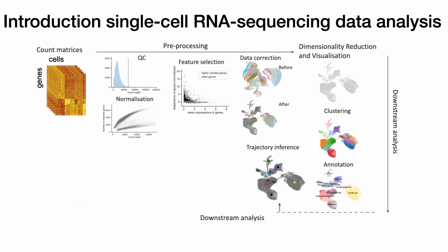So using trajectory inference and pseudotime, you can uncover these kinds of processes, and when you sort your cells along a certain trajectory, you can even uncover the genes that drive a fate decision from one cell type to another.